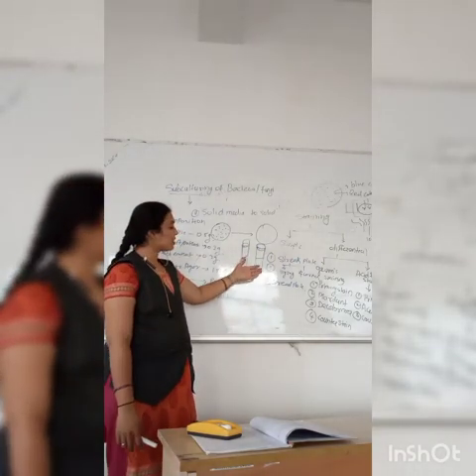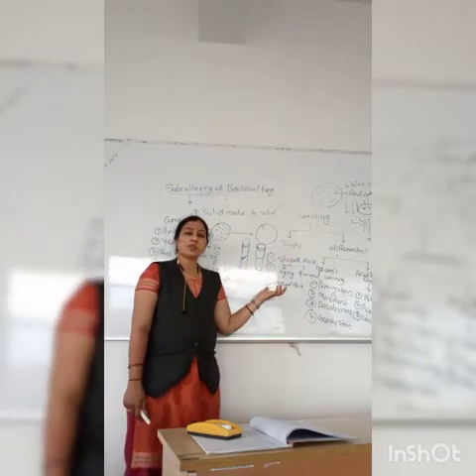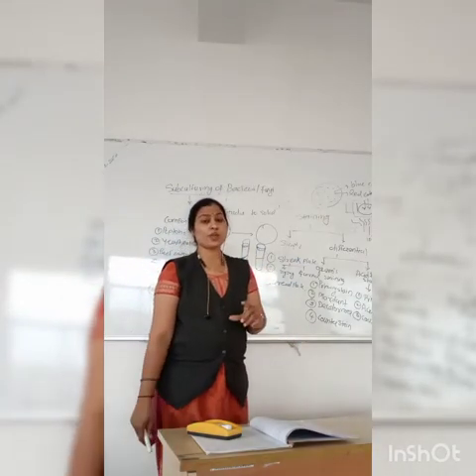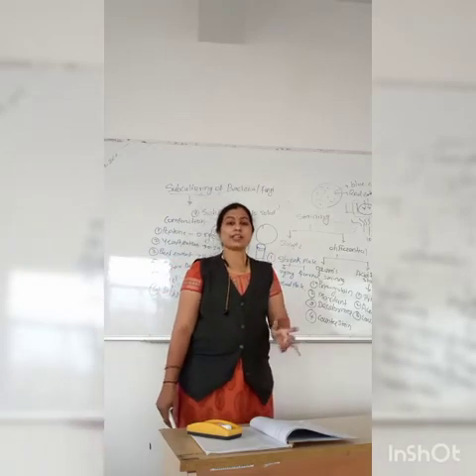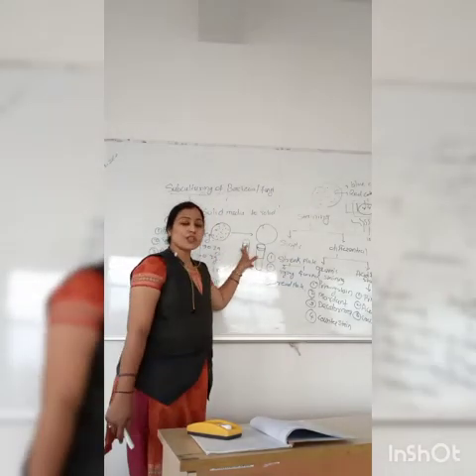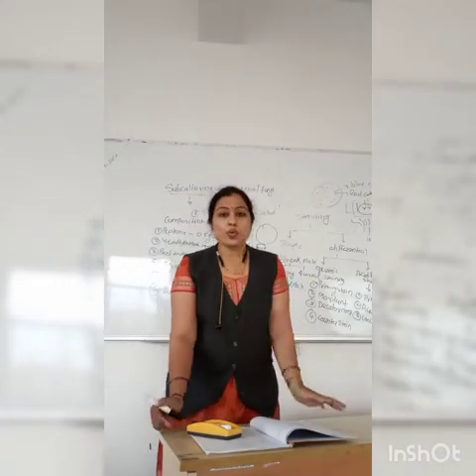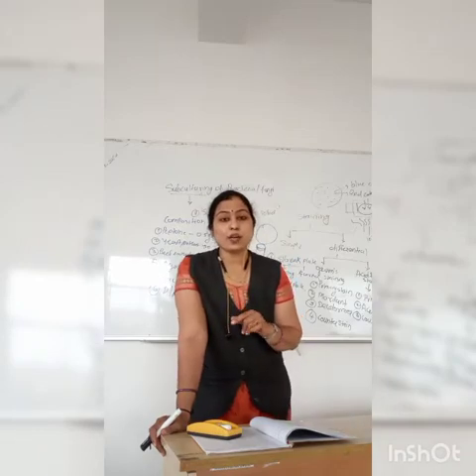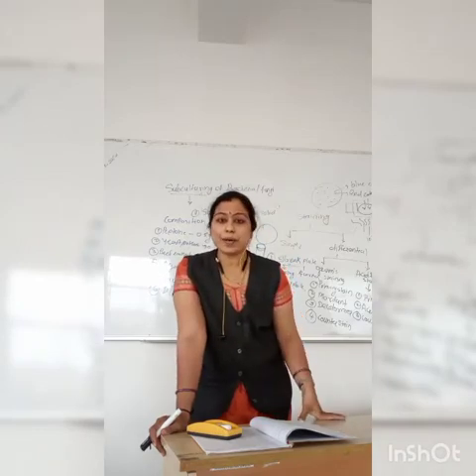And for a stab, add only sterile nutrient agar into a sterile test tube and wait for solidification. The stab is ready. So when the fully grown culture is provided to you, you have to transfer it onto either the nutrient slant, stab, or any type of petri plates.